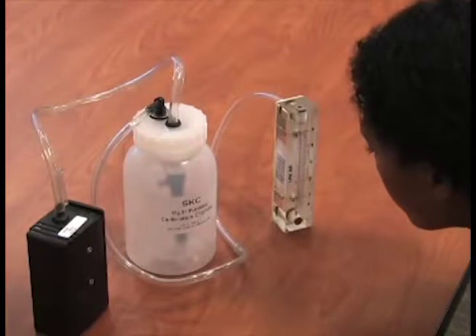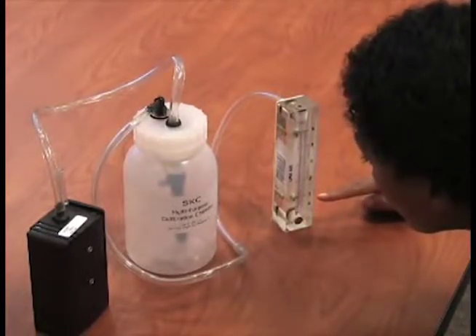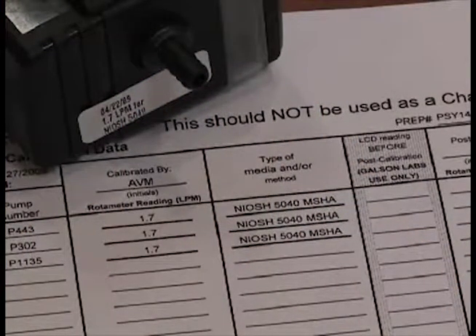Be sure to verify the pump flow rates in an area where you are not exposing the media and equipment to the contaminant, like an office setting. All pumps have the lab calibration information on the pump calibration data sheets provided.